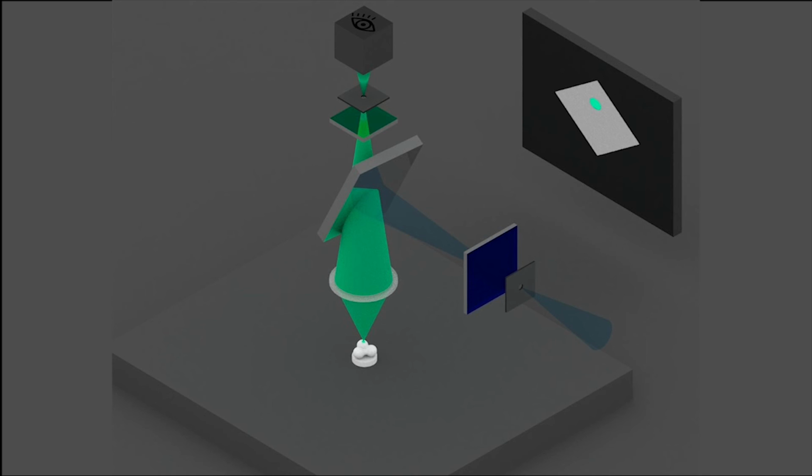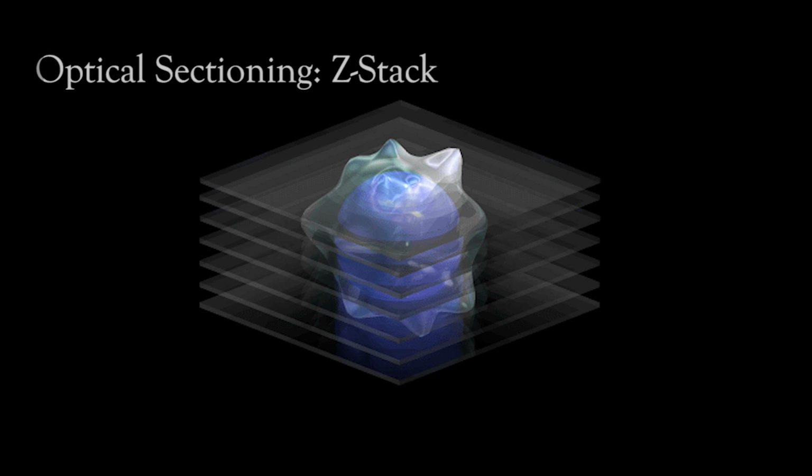The surface of this sample is then scanned by moving the light beam. This allows it to construct a 2D image at a given height. Successive slices make up a Z-stack. One can then move vertically to obtain images at different heights. A volume image of the sample can then be reconstructed with proper software. Confocal microscopes allow us to detect fluorescent molecules in 3D with a good spatial resolution.